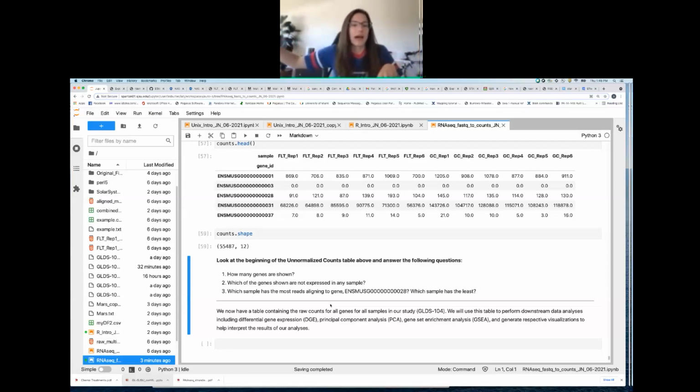And around the same time, someone in a lab in Korea could have been working on something similar, discovered a gene, named it something different, and then submitted it to a database that's incorporated into the next version. And then it turns out that those genes that those two different labs discovered are actually the same gene. And so then it has to get reconciled with a new version of Ensembl. So that's kind of what I mean by there could be duplicates of the same gene.